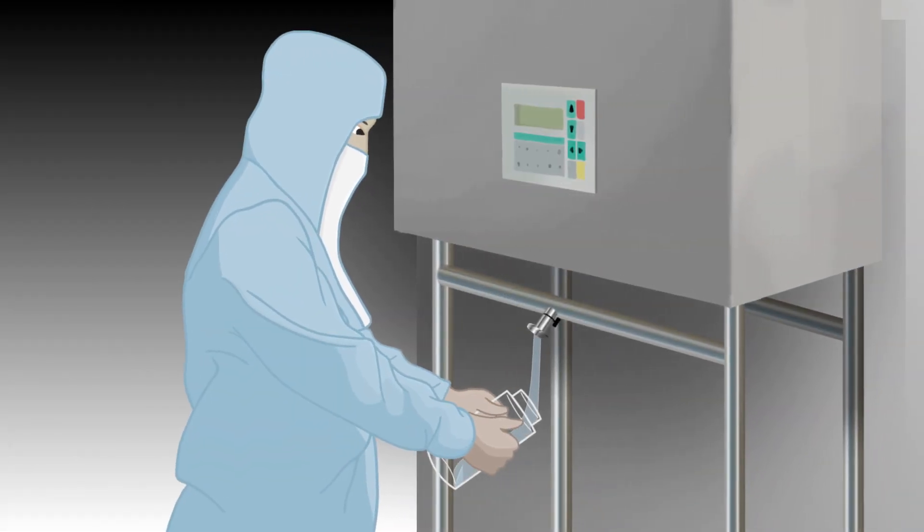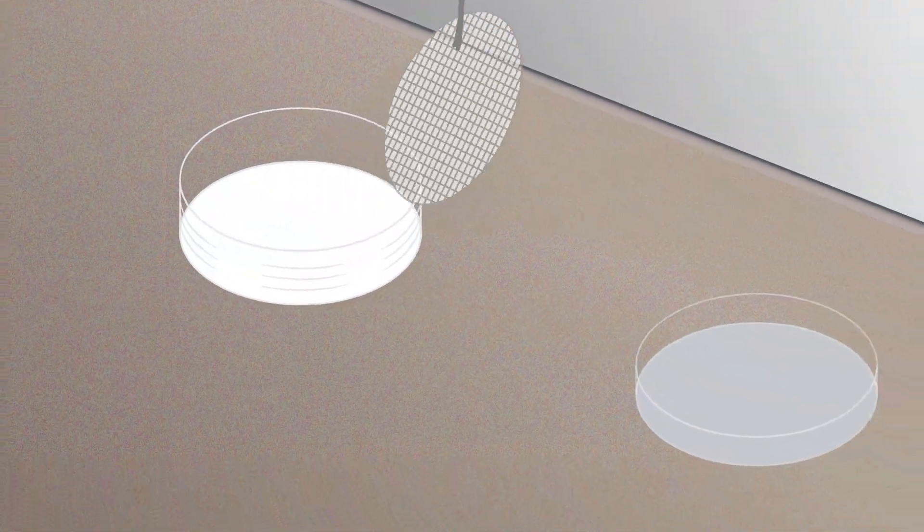No matter how careful you are, contamination can still occur at any stage of sampling.